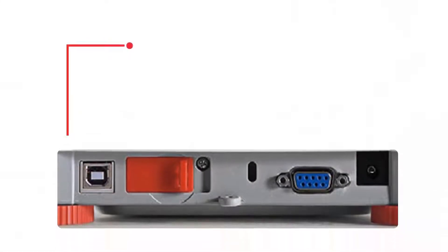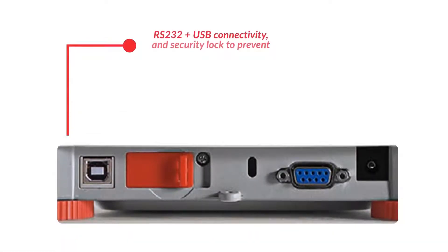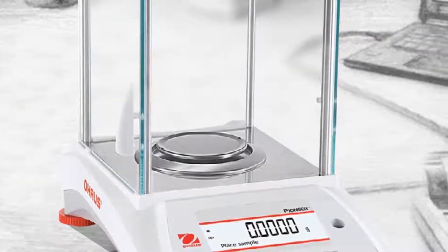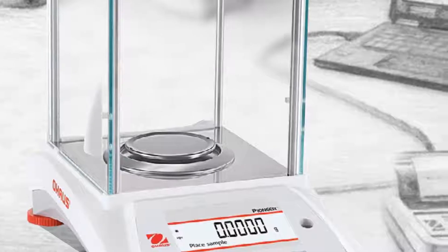Finally, standard RS-232 and USB device ports allow for easy connectivity to printers and other peripherals, allowing convenient capture of results.